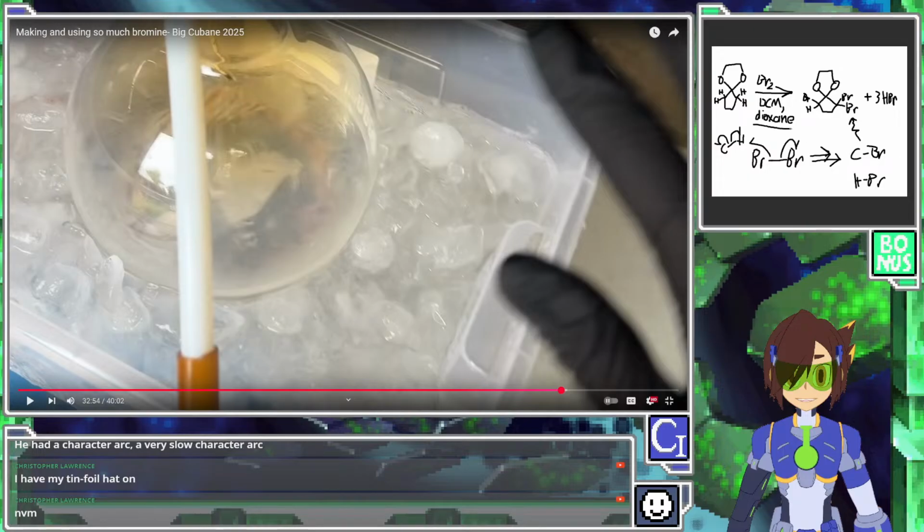The dioxane is necessary, apparently, because it's a good catalyst. I'm not sure why. Even my chemistry knowledge is not completely in tune with this, but the dioxane reacts well with the bromine and makes a carbon-bromine bond that wants to exchange with these carbon-hydrogen bonds better than regular bromine can. Or maybe it also just maintains the bromine in the solution better without causing it to blow everything up to smithereens, metaphorically speaking. So the dioxane matters for that reason, apparently.